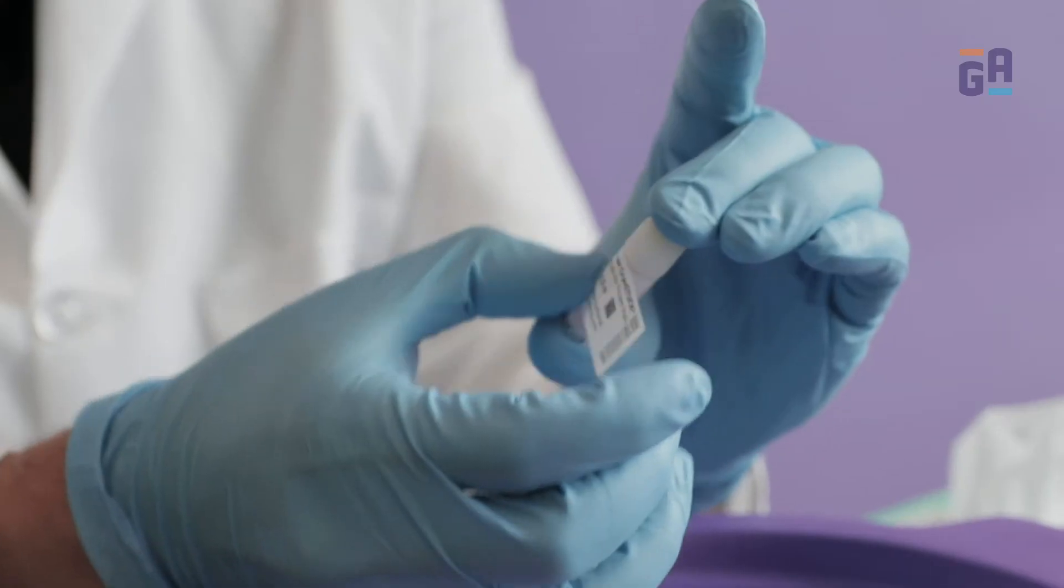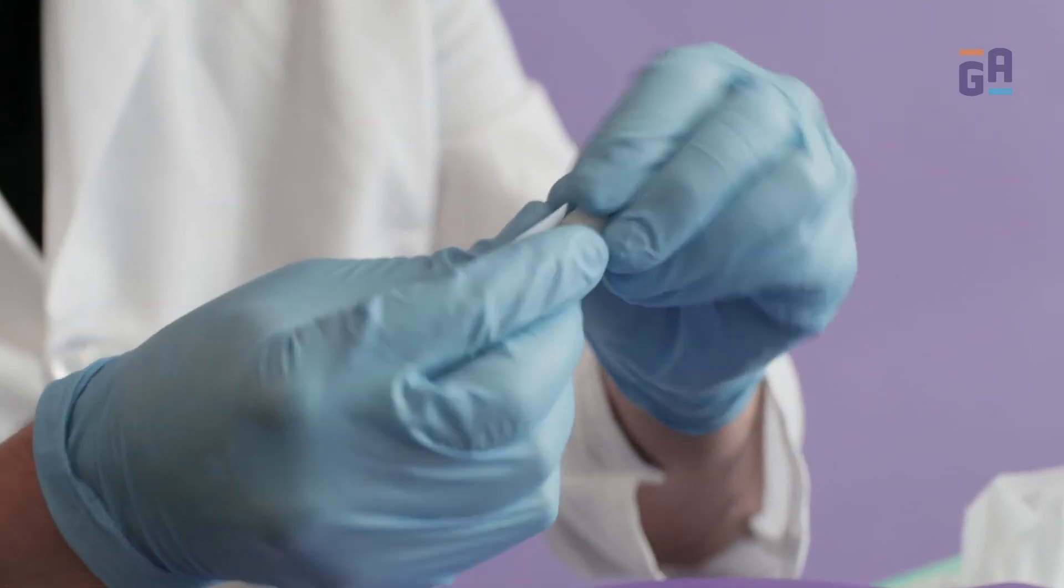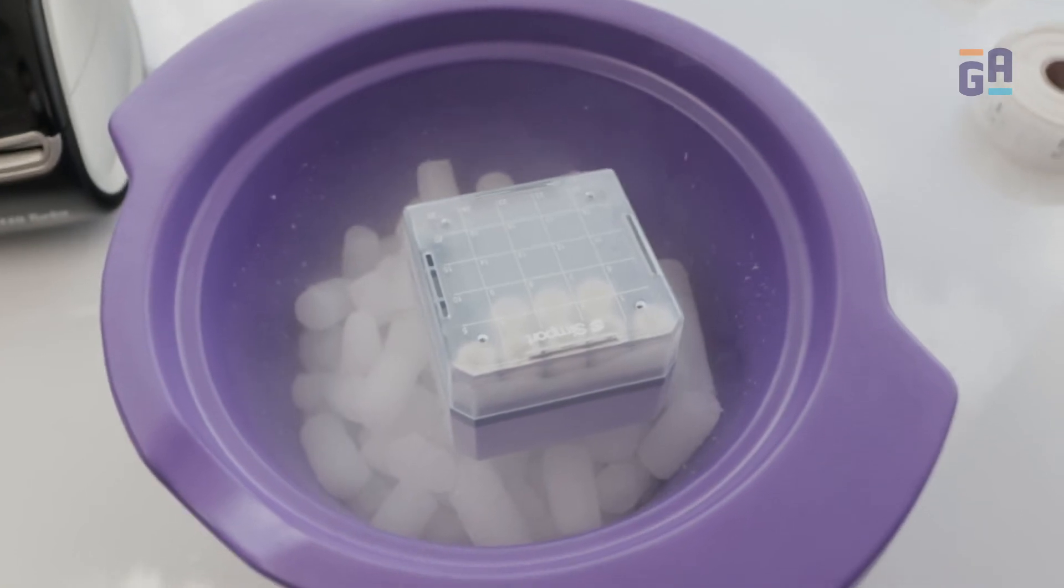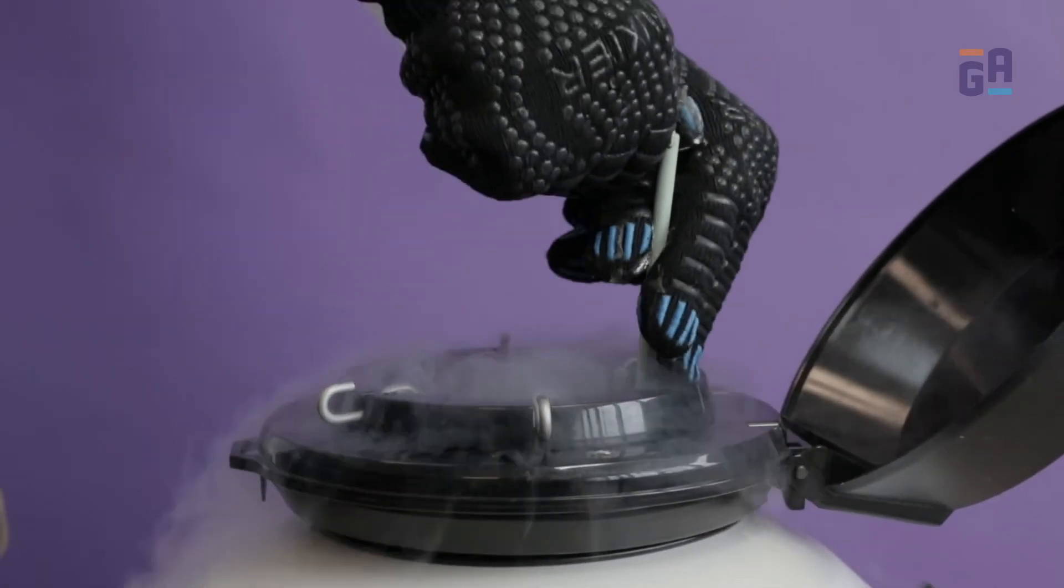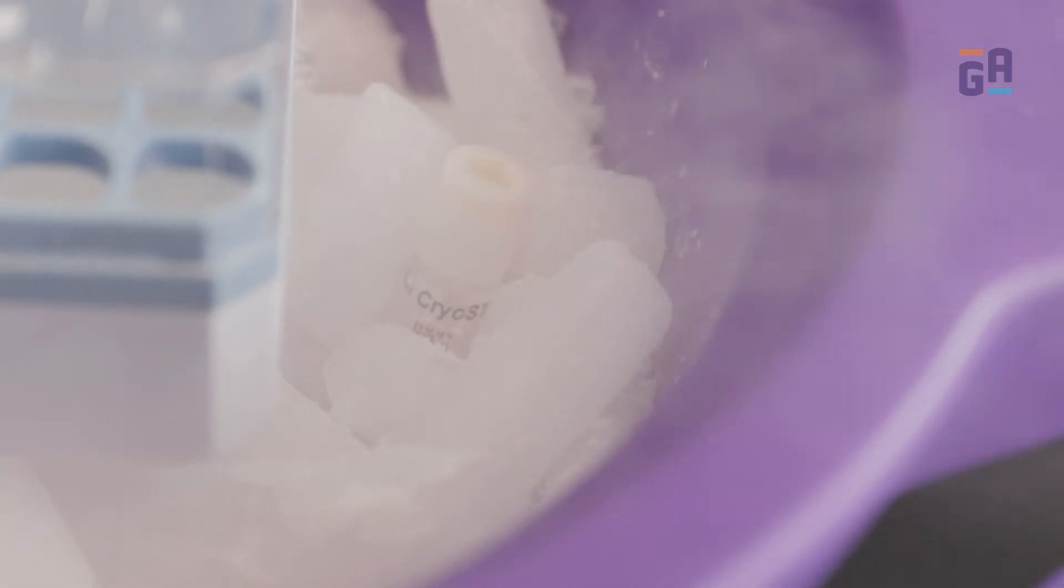The only label that permanently adheres to already frozen containers at minus 80 degrees Celsius, helping you avoid thawing, thus preserving the biological integrity of your cryogenically stored samples.